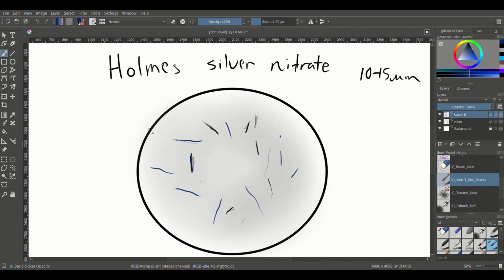You might actually see some unstained spaces around the neural bodies, but we're really looking at neurofibrils here, so that space isn't actually supposed to be there; it's more artifactual with this. So you might see kind of an open space here, but you should be able to see all these fibrils. They should be nicely differentiated, and the background is just going to stay this kind of gray color.